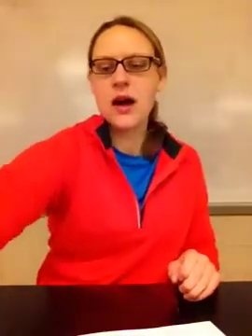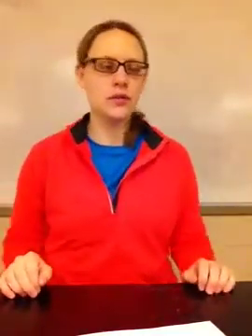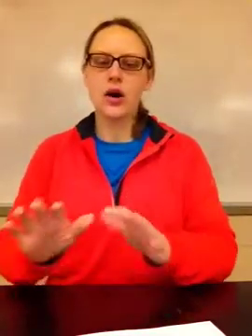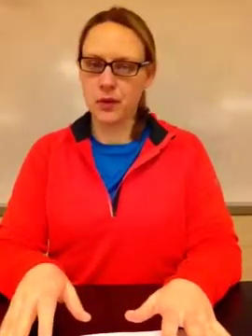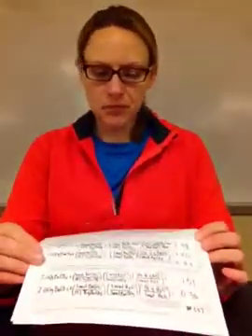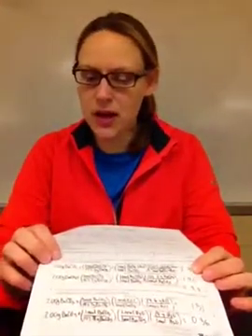Okay, so as I said, you are going to have these 2 white solids that you are going to get in your lab. First thing you're going to do, and I'll walk through this, is go through a calculation page. It looks like this, and I haven't filled in some of mine. I was just doing the math part. You need to figure out how many grams of those two reactants you're starting with. Okay, so that is a mass to mass calculation. You're going to use stoichiometry.